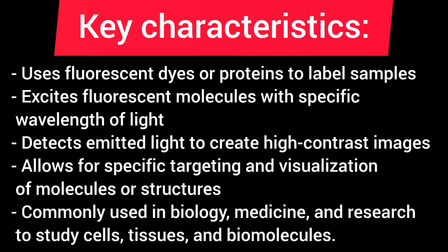Key characteristics. Uses fluorescent dyes or proteins to label samples. Excites fluorescent molecules with specific wavelength of light. Detects emitted light to create high contrast images. Allows for specific targeting and visualization of molecules or structures. Commonly used in biology, medicine, and research to study cells, tissues, and biomolecules.